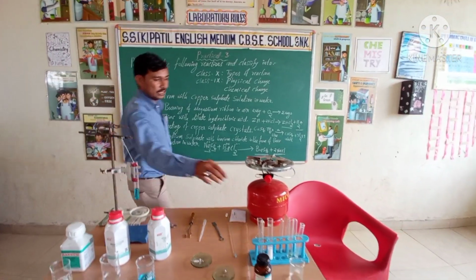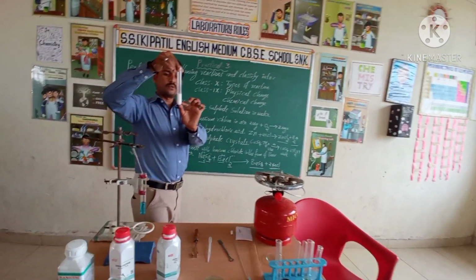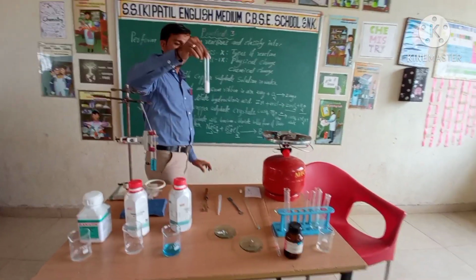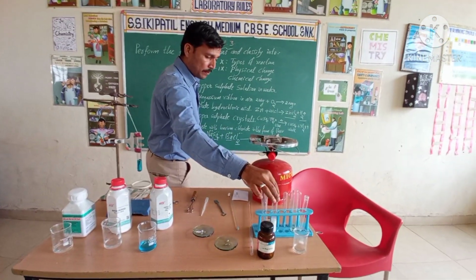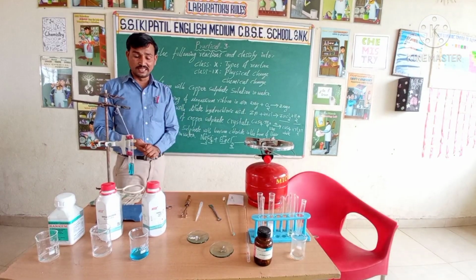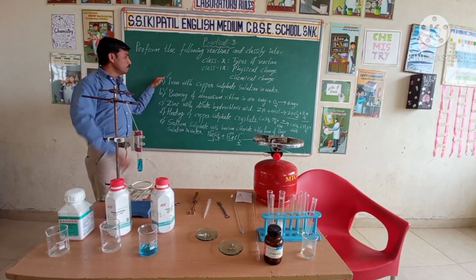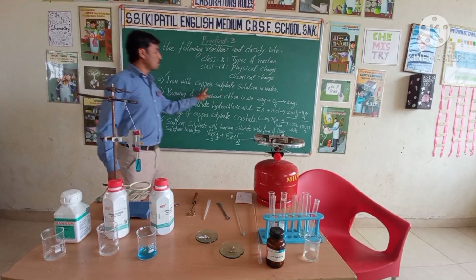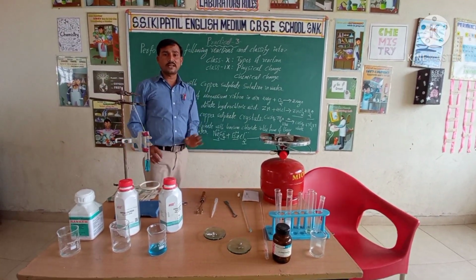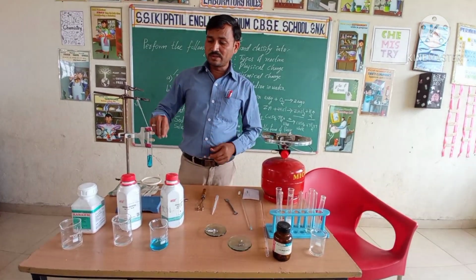Yes, here is the result of this. The white salt will deposit afterwards at the bottom, and you will get a solution of sodium chloride. Now, one more we left to see the result. What is that? The first one we kept for a few minutes, to check what happens with iron and copper sulphate solution in water. We kept this reaction for a few minutes, so we'll check the result of this one now.